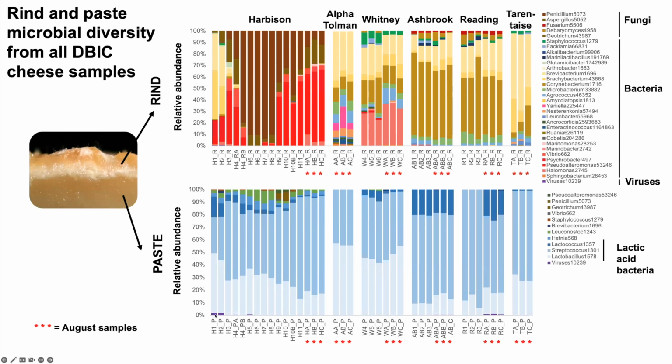Well, these little blips of viruses that you're seeing come and go, those viruses could actually be what are called bacteriophages, or just commonly phages. Phages are viruses of bacteria. They're not a harm for you and I. They're a harm for bacteria, though. And so these little blips that we're seeing could be examples where viruses are actually attacking the bacteria in the cheese. We don't know that for sure, but work by Rachel Dutton's lab has been showing that there are some interesting phage-bacteria interactions happening.